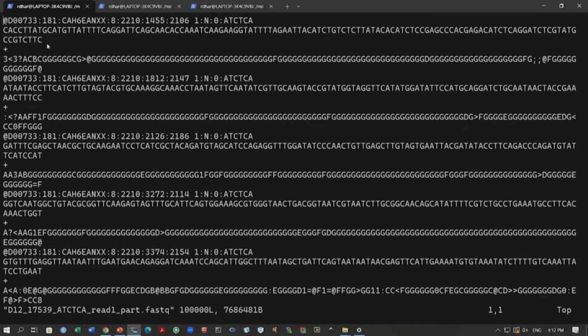Now, to enter this write mode, you have to press I. The moment you press I, what you get is this INSERT. You will see this here, all these details are right at the bottom. So, you see this INSERT means you are in the write mode. If you want to come out of this write mode, you have to press escape, and that INSERT indicator is gone. So, you can go into this write mode and you can start looking at this file.